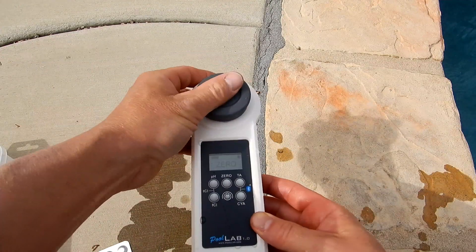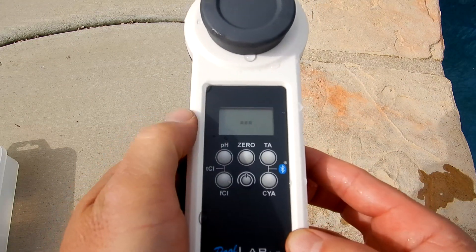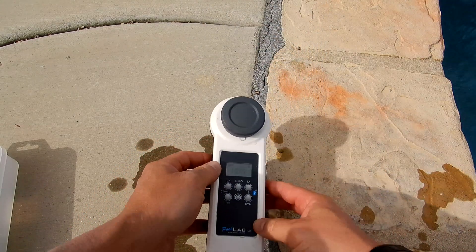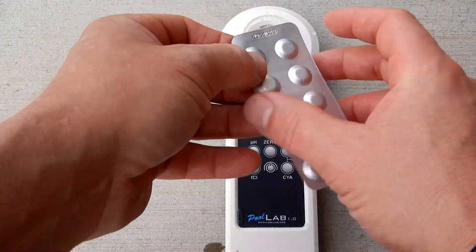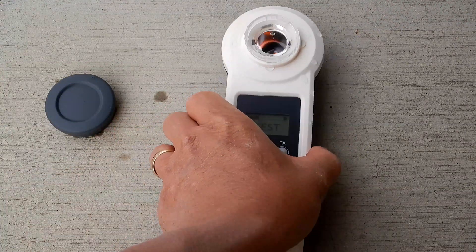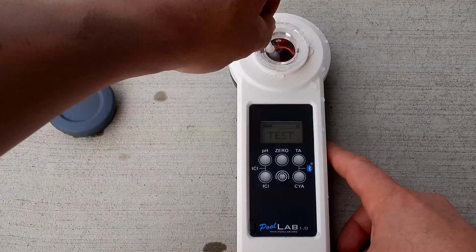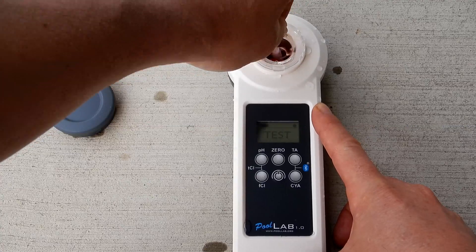We're going to go ahead and zero out the device. Cover it and hit the zero button. Now we can do the test. You don't want to touch the tablet, so push it through here. You can see the tablet in the chamber — go ahead and break it up and stir it using the included stir and crusher. Make sure the tablet is completely dissolved before you run the test.